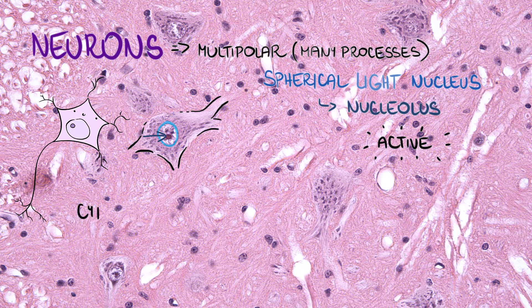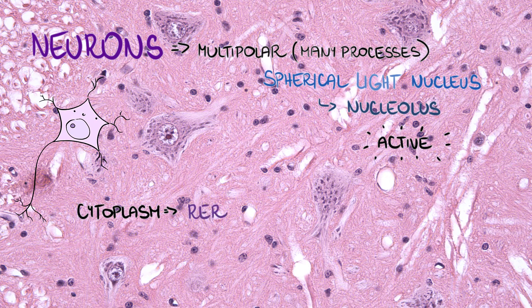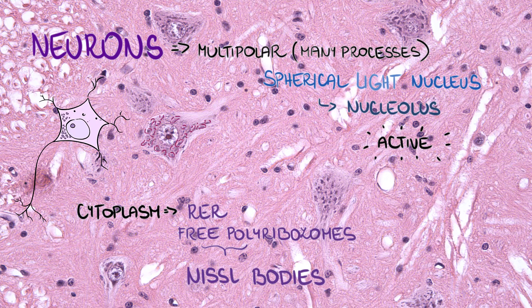Cytoplasm contains rough endoplasmic reticulum and free polyribosomes, and they are organized in Nissl bodies — these basophilic dots, or so-called Nissl substance. That's why the whole cytoplasm of the neuron is described as basophilic.